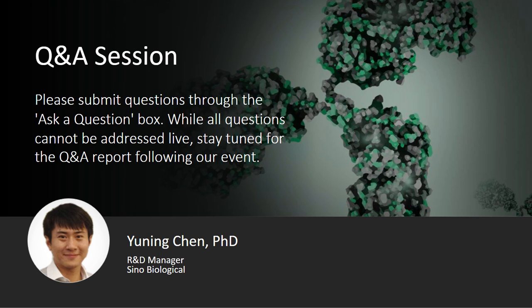However, we do observe sometimes antibodies are not stable in PBS buffer, and in this case, we will have to either switch the buffer base, for instance, using a TRIS-based buffer, or even other physiological buffers such as MES or HEPES, based on the stability of the antibody. And also, sometimes we would consider putting some additives into the system. For instance, glycerol is the most common additive, and it has proven to be the least problematic of the many. Other additives include some sugar residues or a small amount of detergent, which can also sometimes be introduced.